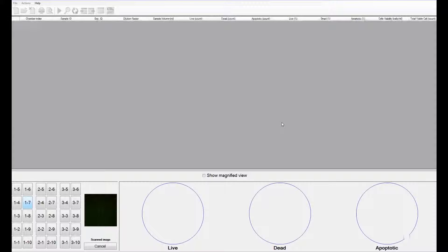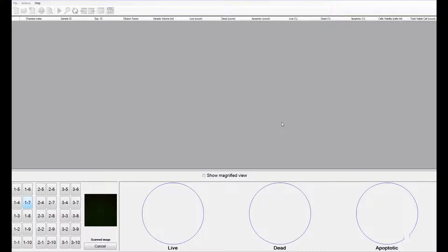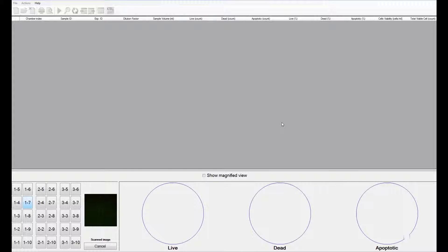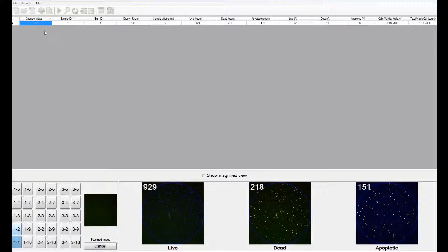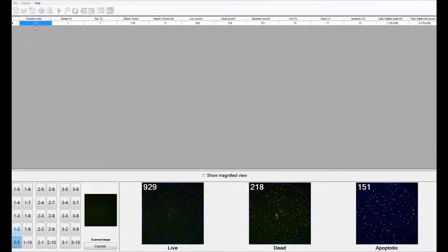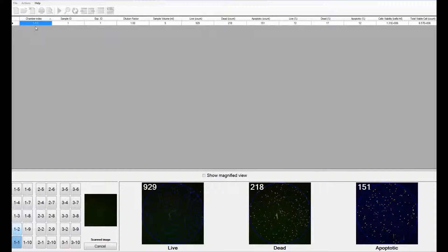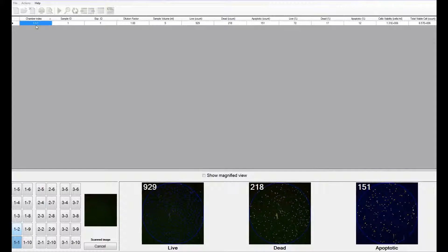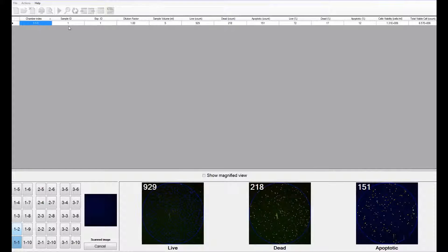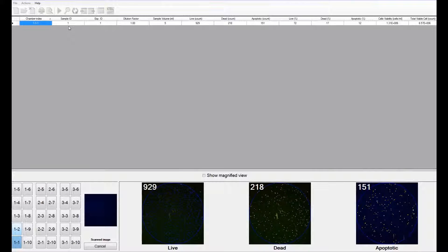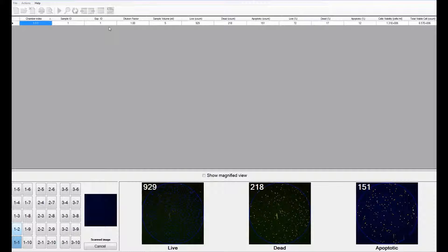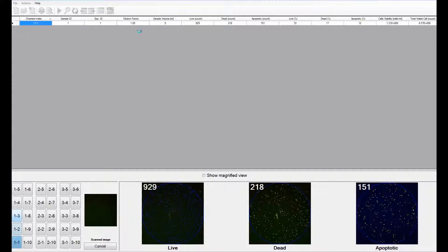You can watch the software computing the live, dead, and apoptotic cell numbers and then displaying them as and when it analyzes each chamber. The software displays the chamber index, 1, 1, 1, which represents the first tray of the first hemocytometer and the first chamber. If you had entered sample IDs, that would show up here, and so would the experiment IDs.